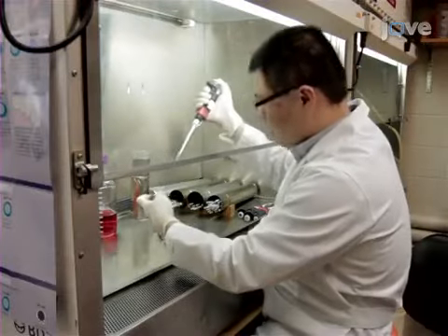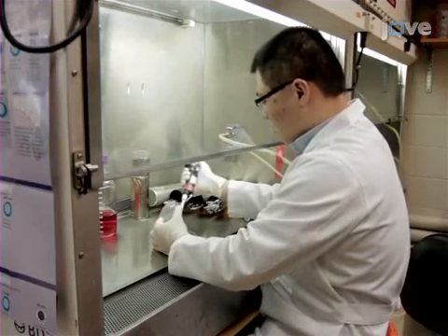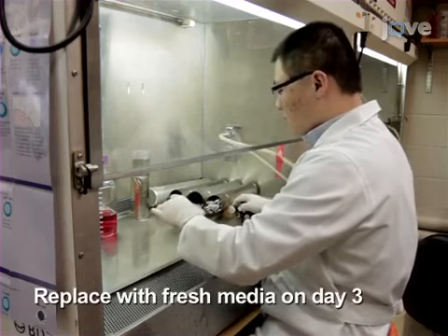On day 0, transfer 5 × 10⁴ iPS cells onto a 100 mm culture dish containing a confluent OP9DL1 cell monolayer in 20% FBS alpha MEM media.